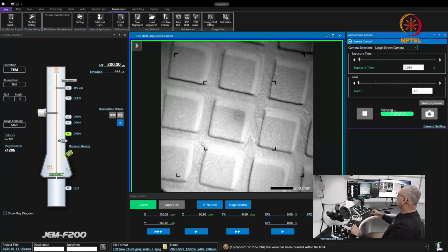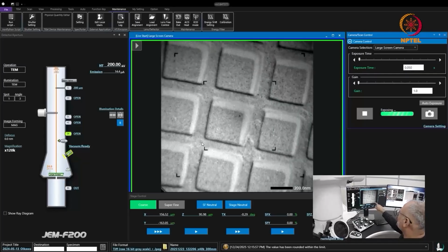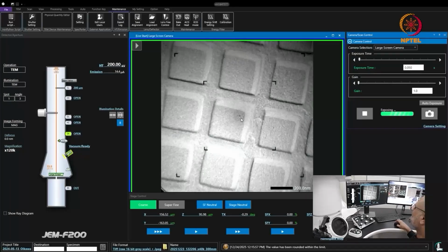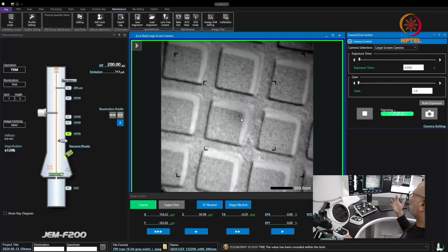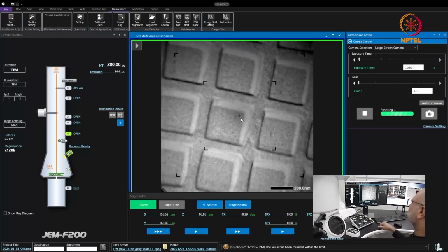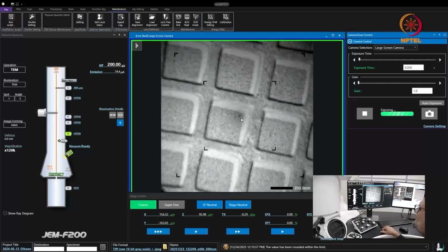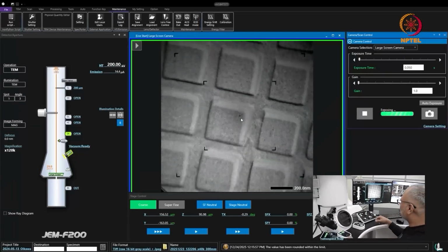So if you see here, the corners from the area, which is the edge of this ring here, and the central feature is more or less going along the z-axis of one plane, in and out of the screen. It appears that way. At this condition, you know that the HT wobble is more or less corrected. When I started, it was also reasonably fine. If you are in this condition, you need not really misalign it. Sometimes you may have a situation where the HT wobble is quite misaligned.